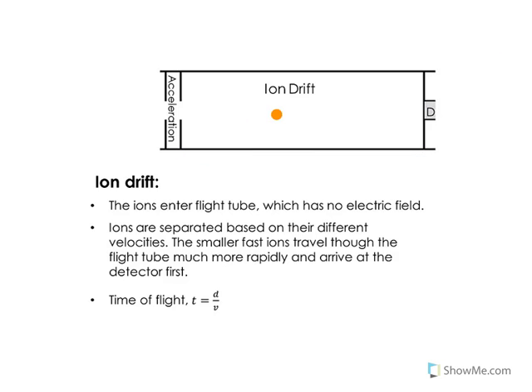Once the ion has been detected, of course, the others continue to move, and the time for the next ion would be detected, and so on and so forth. So a series of different signals would be detected at different times, depending on the velocity of those ions in question, which itself depends on the mass of the ions in question.